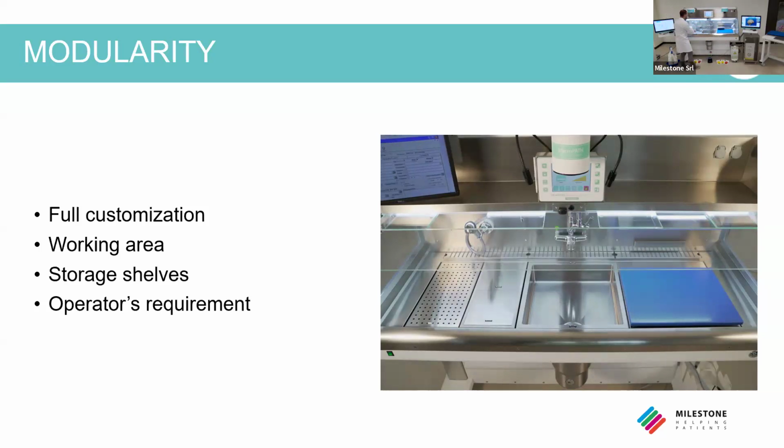Then the formalin contained inside the bucket is drained into the dedicated funnel. Then the sample is taken and washed if needed. For example, a colon must be cleaned, of course, before the grossing activities, and then positioned on the cutting board for starting the grossing activities.